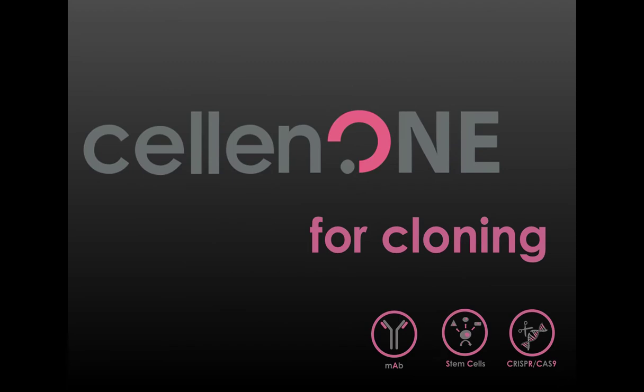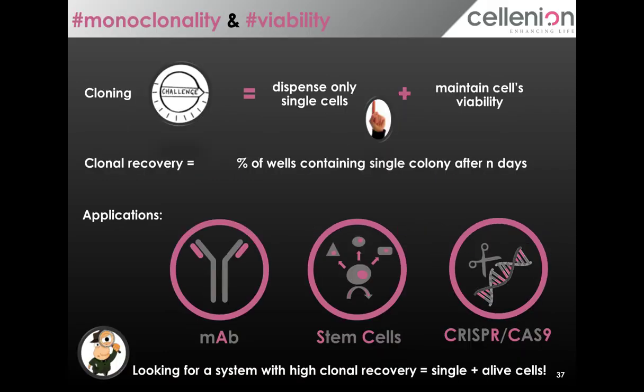So we're jumping into one of the applications that we're focusing today, which is cloning. And we've already mentioned the main challenges of this application, which is, first of all, we want to find only single cells. And we, of course, want these cells to stay alive. So we have defined clonal recovery as the percentage of wells which will be containing single colony after an X amount of time.